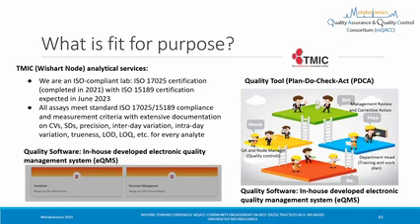Nice response from a colleague at TMIC here. So this is an organization, I think, a little more service-oriented, now working to ISO certified methods, right? So they are an ISO compliant lab. They have a nice quality system here with actual QA and node managers, right? Actual personnel in place to make sure that whatever is discovered, the data that's generated, is checked.